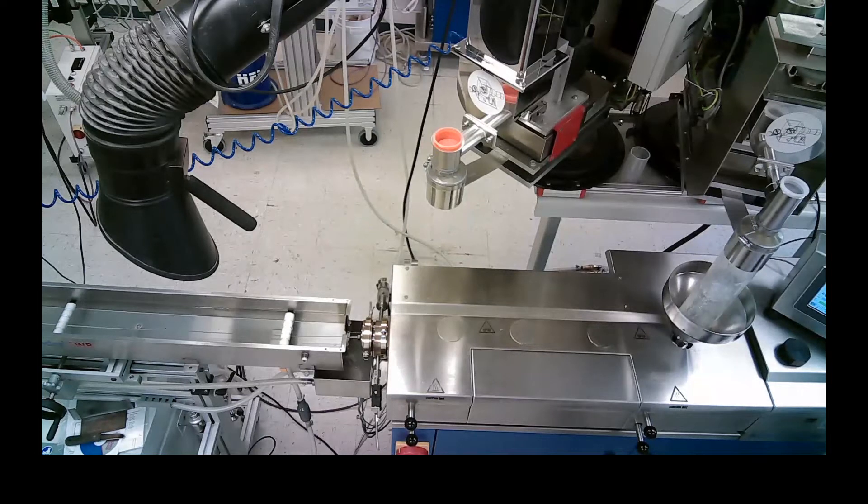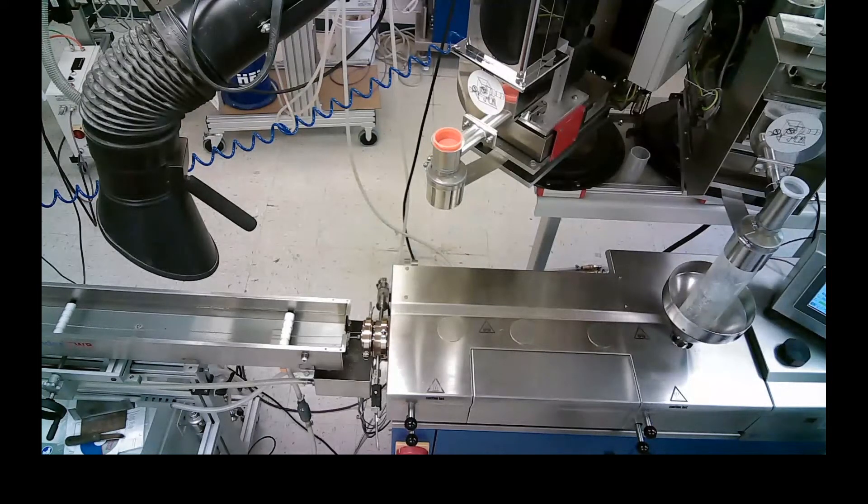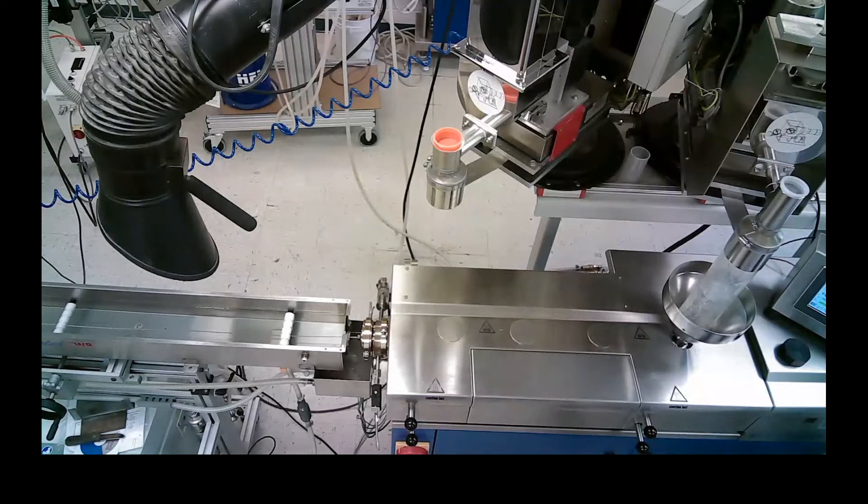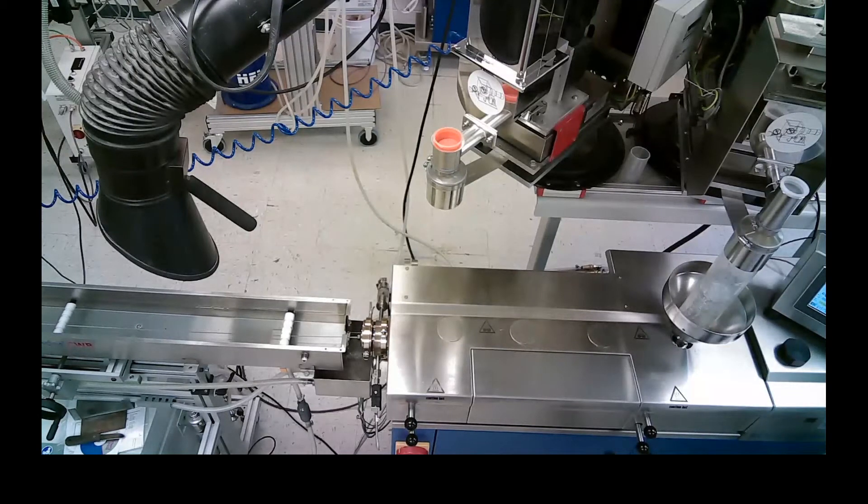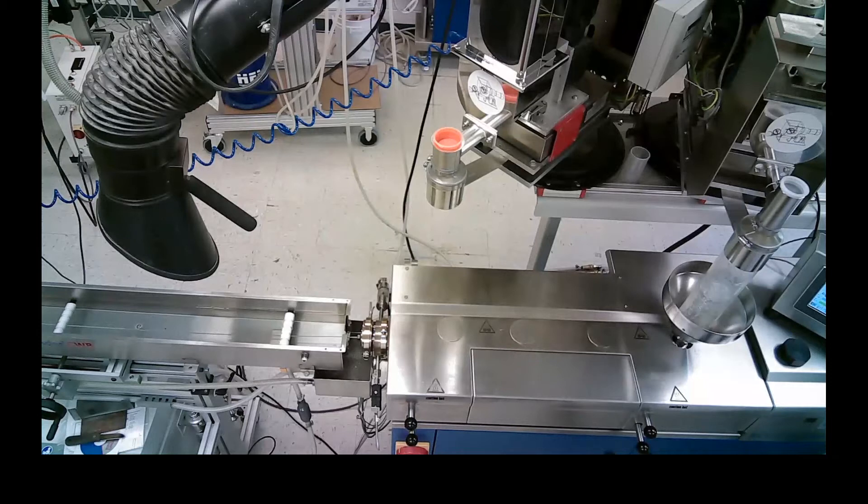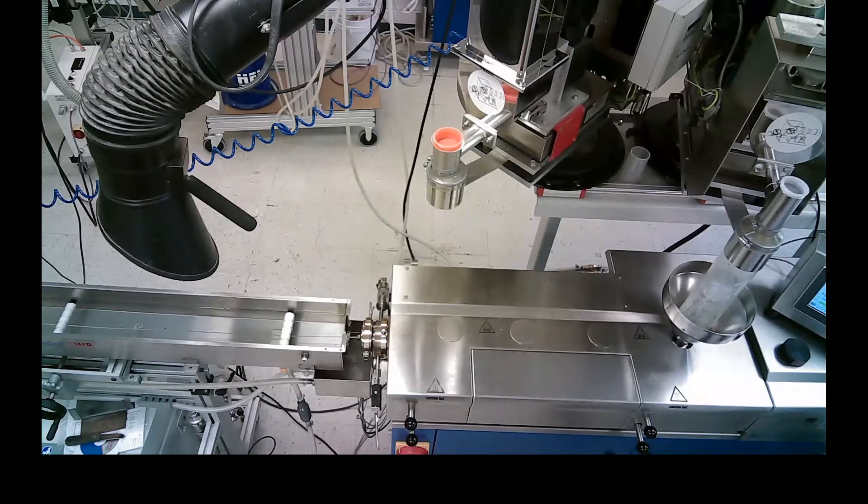Here you see our standalone 20 millimeter clamshell parallel twin screw extruder. We have this available in 1200 rpm or 600 rpm. It also comes either as an attachment or a standalone version.